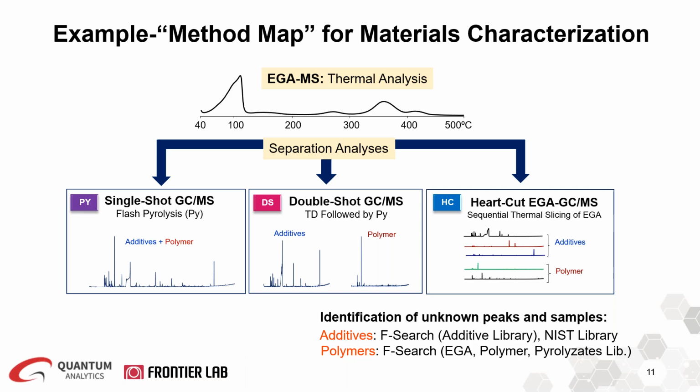So all the additives and all those light volatile compounds will be thermally extracted from the sample. And then once your GCMS is running, once it's collecting all the data, your cup goes back up in an ambient temperature. So you're not exposing your cup and your sample to any heat in between the runs. Once it's done, and since your furnace is then programmed for the next step, which in this case I would say 500 C, once the furnace is set at 500 C, the cup falls again back to the furnace to perform the second analysis on your sample.